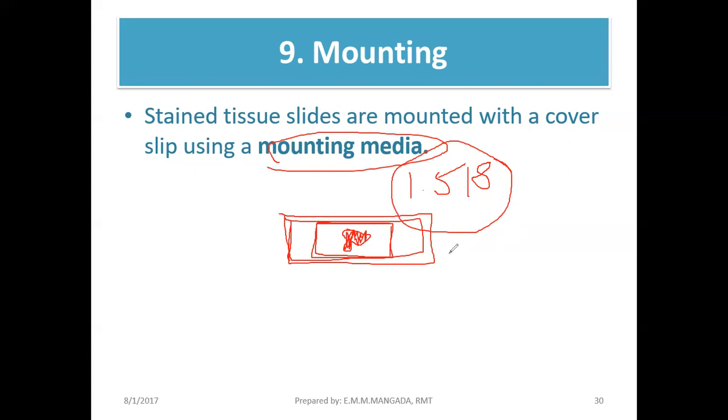So guys, the most commonly used mounting medium is Canada balsam. This is derived from a tree known as Abies balsamea.